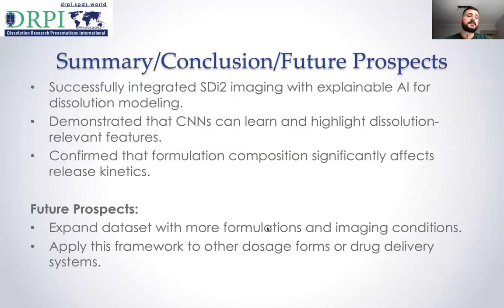To sum up, this study shows the ability of the SDI2 integrated with artificial intelligence to predict the dissolution profile. Also, the convolutional neural network was able to learn and highlight the dissolution-relevant features. And formulation composition was shown to significantly influence the release kinetics.